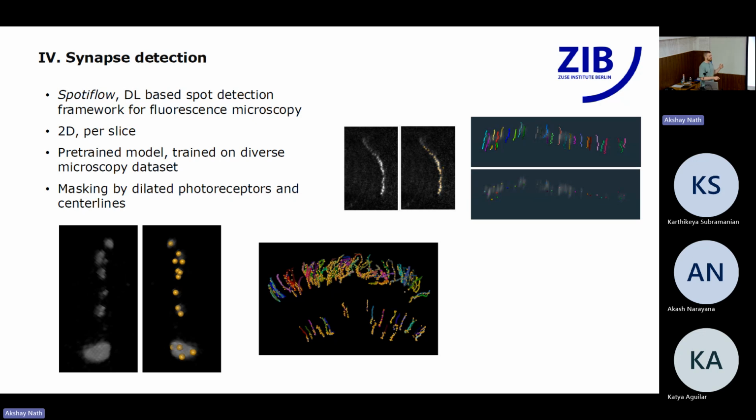Okay. Yeah, but because we do it by slices, if two slices are very similar, adjacent slices, then probably the same synapse is going to be highlighted in both of them. So after we stack them back together, we're going to end up with these lines representing synapses. I don't know whether this is clear. I know it's not very intuitive.